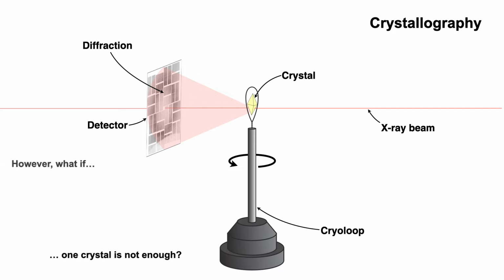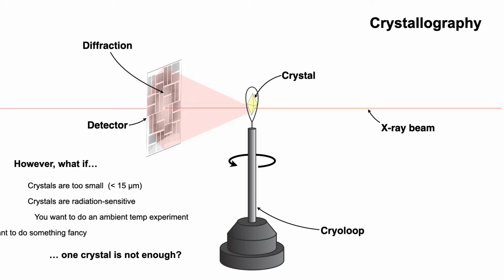However, what if one crystal is not enough for this? What if your crystals are too small? What if they're too radiation sensitive? What if you would like to do an experiment at ambient temperature, or do something fancy like vary the temperature throughout the experiment, or expose your crystal to an electric current?